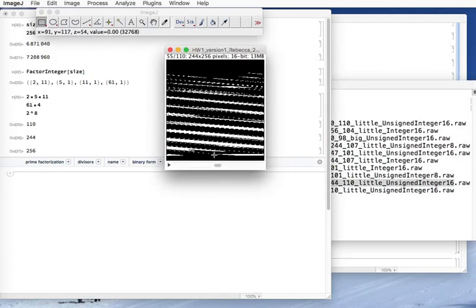Well, this is a sign, an indication that at least rows and columns are interchanged. I'm putting the cursor over here to the upper left because I know in advance that's likely to be error and either 0 or at least very small. And I'm looking at the numbers that are shown over here. I see 0.